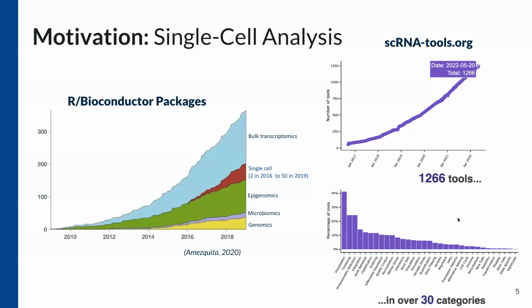And with data comes a lot of tools to analyze said data. We have all these Bioconductor packages, all these R tools. We have this little web app called scRNA-tools, not by us, but it's a good tool to check the current date. This was as of last year.